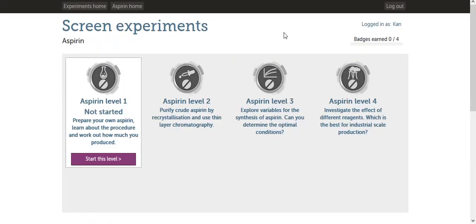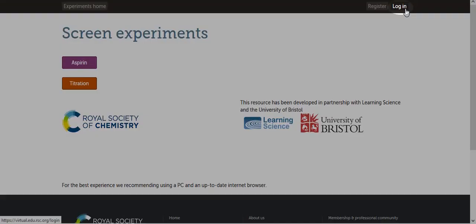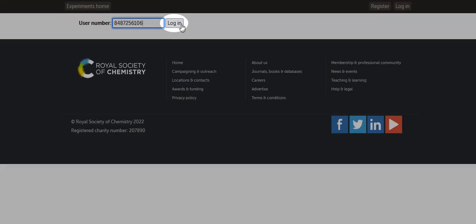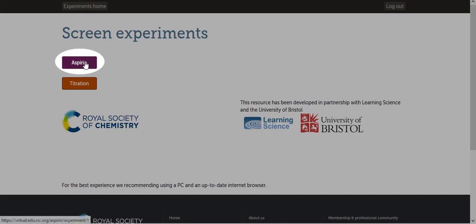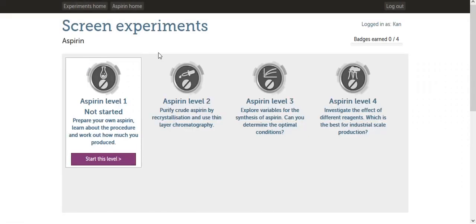Before we begin, let me show you how to log back in. Let me first log out. To log back in, click the login button on the top right corner of the page. Then enter your user number and click log in. Then click the Aspirin purple button. Now we're back at the screen experiment page.